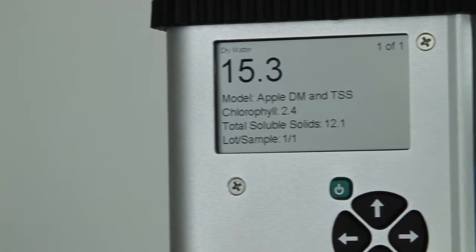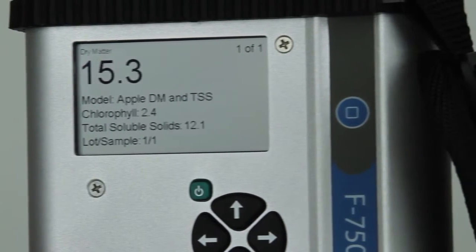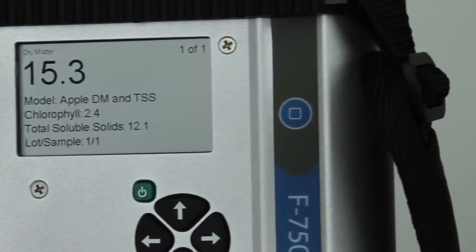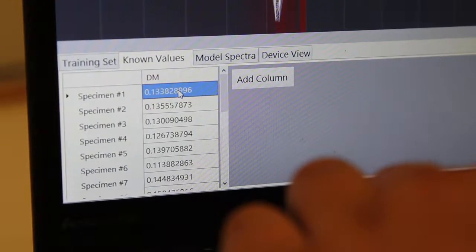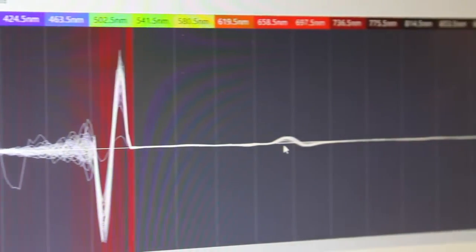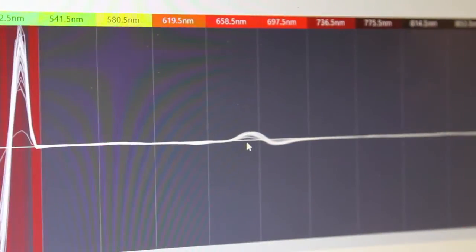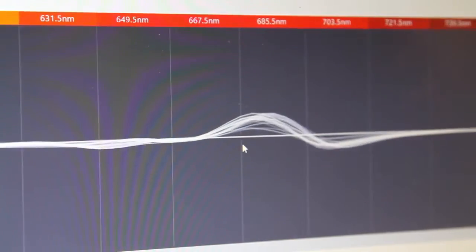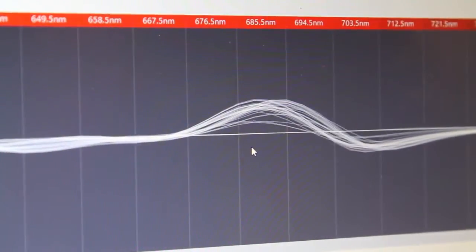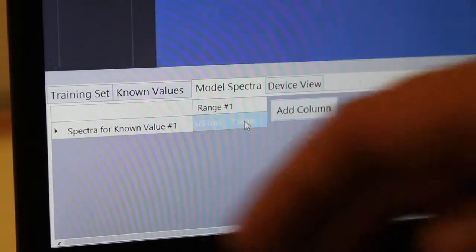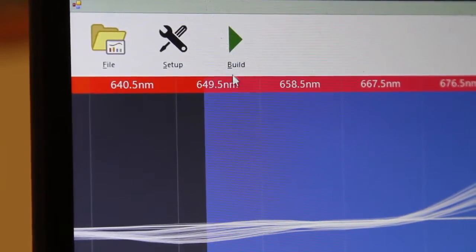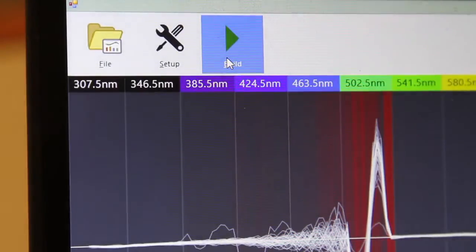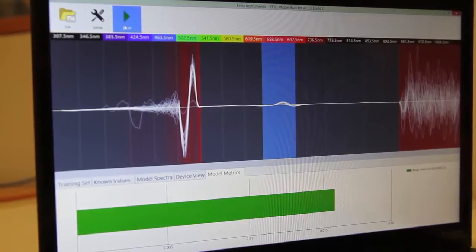In order to measure produce quality, users must first build a model tailored to their product. Our software package, included with every instrument, allows users to create models and use them seamlessly with the F750 to determine whether any given sample meets their quality standards non-destructively.